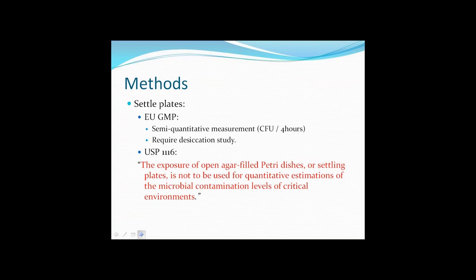And those familiar with Annex 1 will know that it recommends semi-quantifying any counts recorded on the settle plate by expressing the number of colony-forming units as the CFU recovered over a 4-hour period. So here we have a difference.